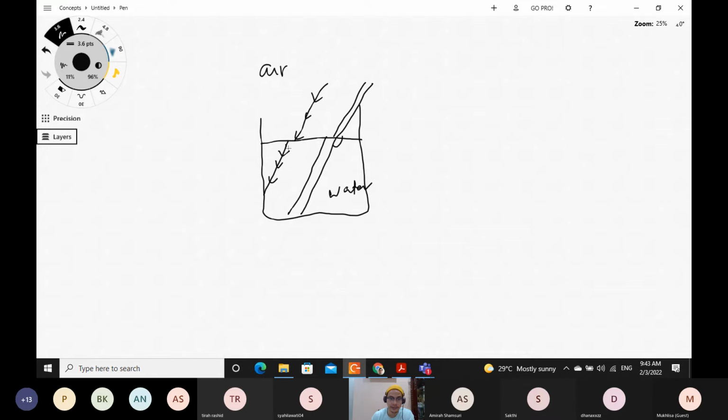So there's an angle yang kita dah identify. So kita boleh gunakan angle ni sebagai kaedah untuk kenal pasti. Identification. Angle ni unique to different medium. So different crystal, different liquid lah. Air at a different angle. Air pula, kita confuse dengan udara.